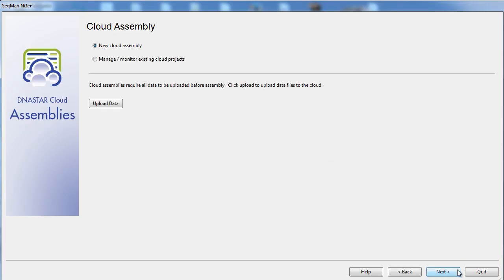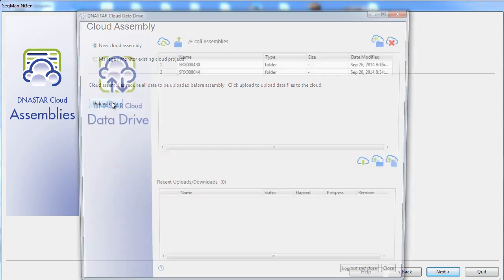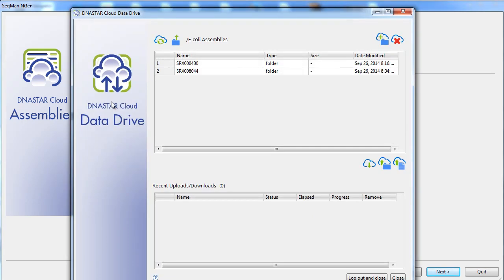You will then see how many assemblies remain on your purchased license. On the following cloud assembly screen, you have the opportunity to upload the data you are using for your project. This opens up our DNA Star Cloud Data Drive tool to easily transfer your data to and from the cloud.